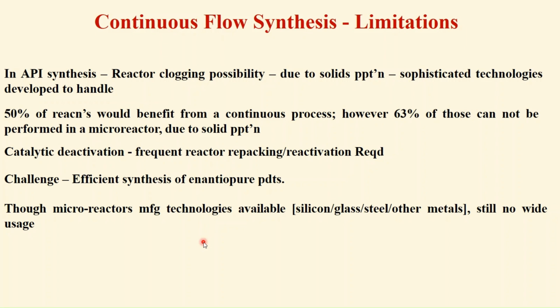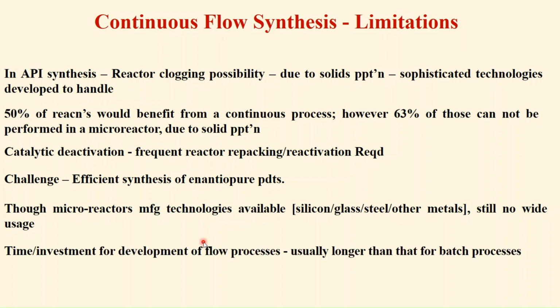Anyhow, continuous flow system is an emerging technology where we have a lot of investment. Not only the investment, we have to invest our time. That's why it takes a longer process as of today, as it has not been as developed or as established as that of batch reactors. But however, this is the future of synthesis.